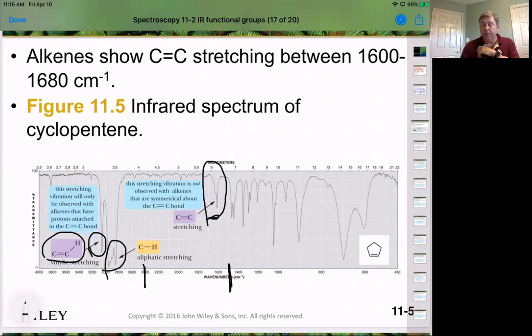Now that we have different types of frequencies between the different carbon-carbon single bonds, we start seeing more and more of these peaks come in, and that's different bending and stretching modes. But the key ones that we're looking for is the fact that we now have a new peak in this range, and we still have our carbon-hydrogen peaks up in the carbon-hydrogen peak range.